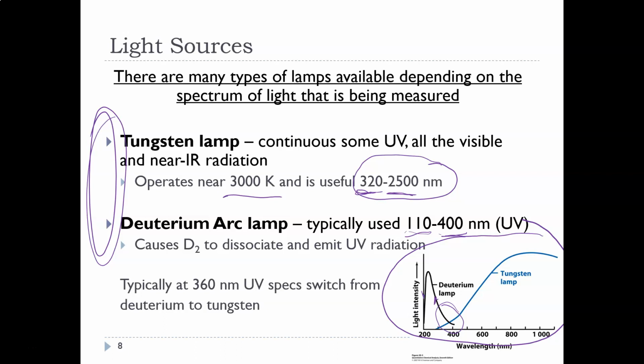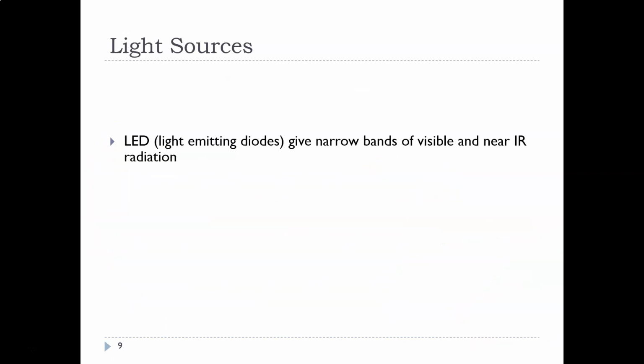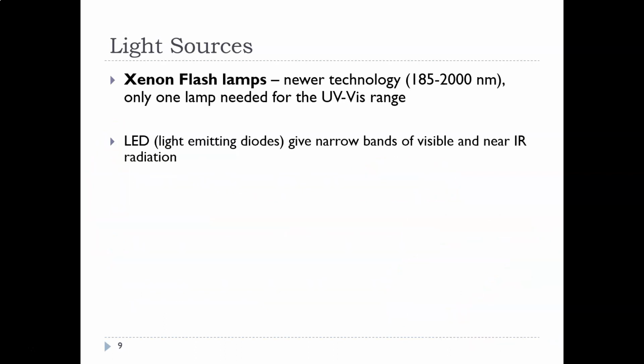Deuterium is part of this lamp and it deteriorates just naturally, and it emits this light as it does that. The unfortunate part is that whether or not you turn on your deuterium lamp, you need to replace that sucker every year for us, but it depends, every couple of years, because it will naturally wear itself out because it's basically on all the time. They just block it off so its light is not reaching the sample if we're not turning on the deuterium lamp.